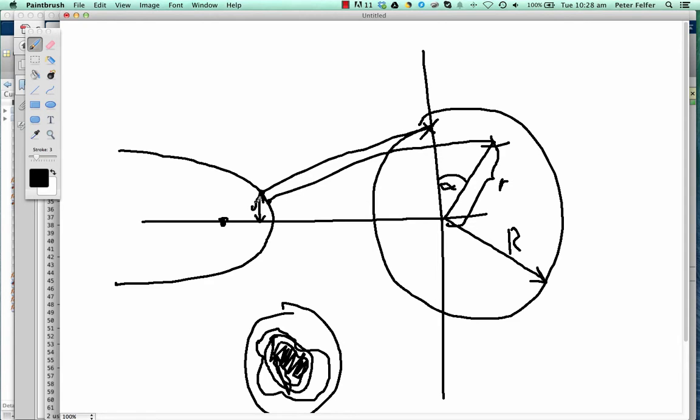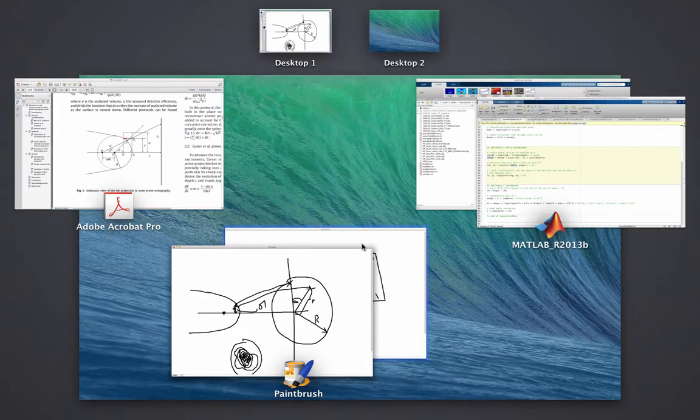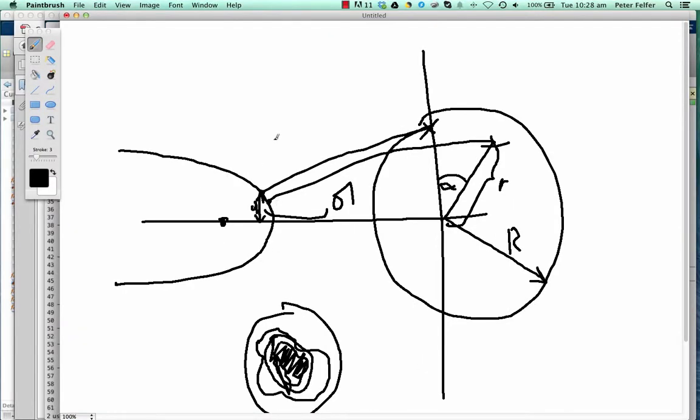So that's d. And the other thing we're getting is the Z shift. So the Z shift is simply this shift here. So that's ZP, which we're later going to use for the Z reconstruction.